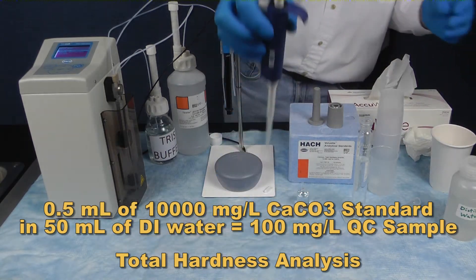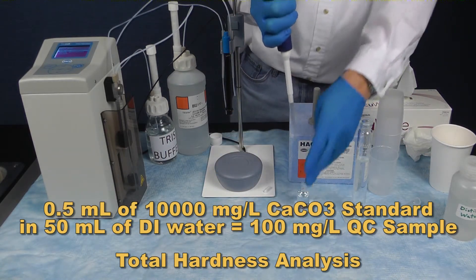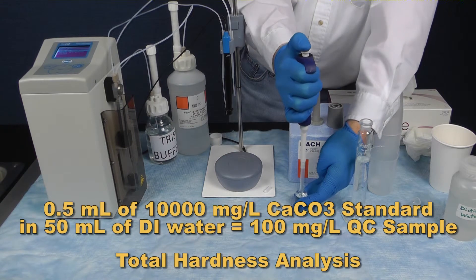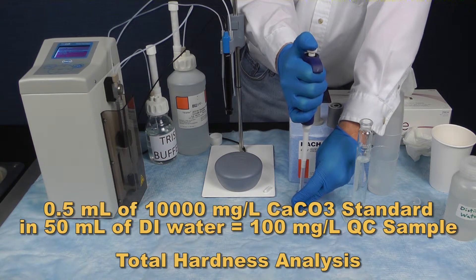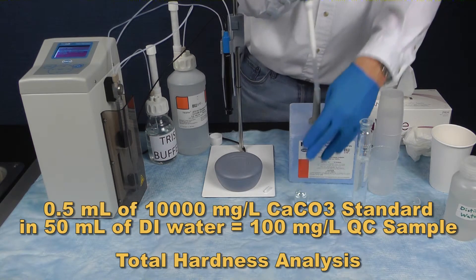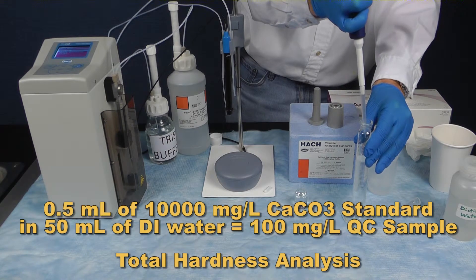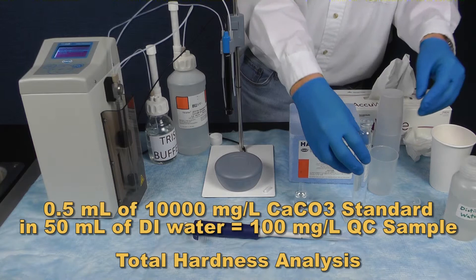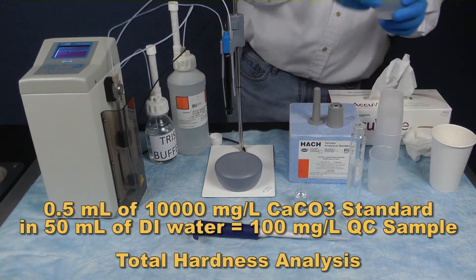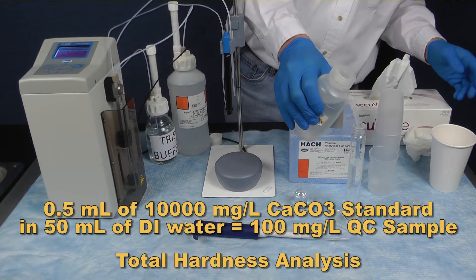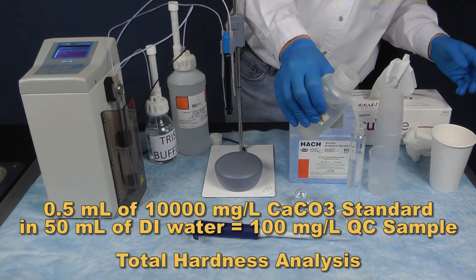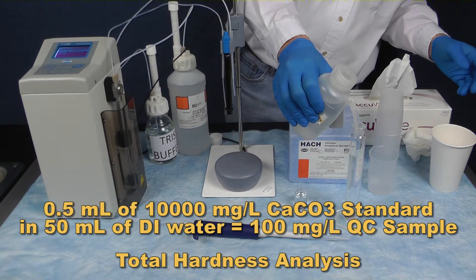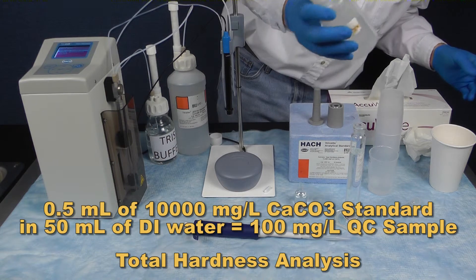Pipette 0.5 mL of 10,000 milligrams per liter CaCO3 standard into approximately 40 mL of DI water. Bring the volume of sample to 50 mL using DI water. Mix well, then pour into a clean sample cell.